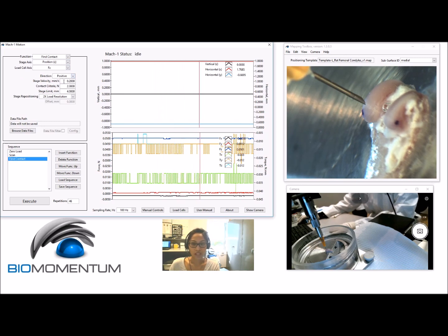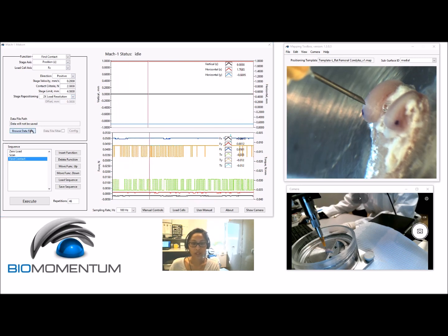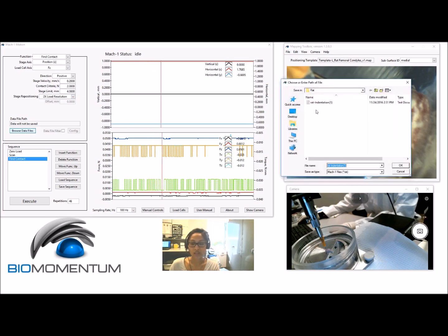Then add a find contact function, where the parameters are specific to each sample type. Don't forget to save the data from the find contact function.